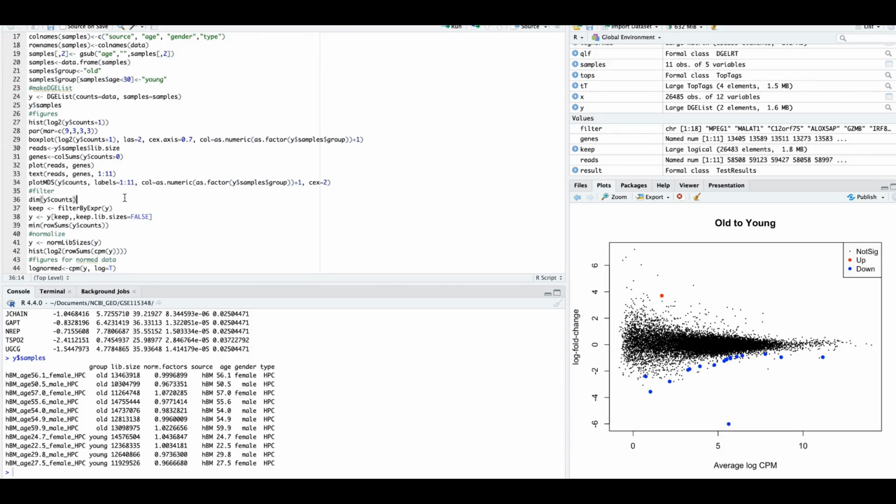But if you remove the gender, all the differences are assigned to the group. In other words, the results are inconclusive. We find the differentially expressed genes, but there is an uncertainty on this list. What is actually defined by the age remains unknown.